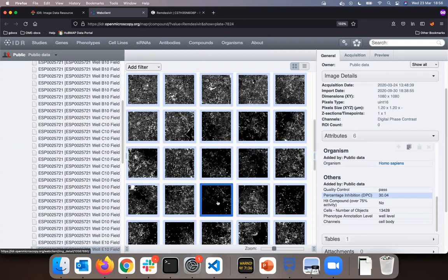The possibility exists to study further the analytical results submitted by the authors, such as I did right now, but in a more productive and effective manner using the Omero API.